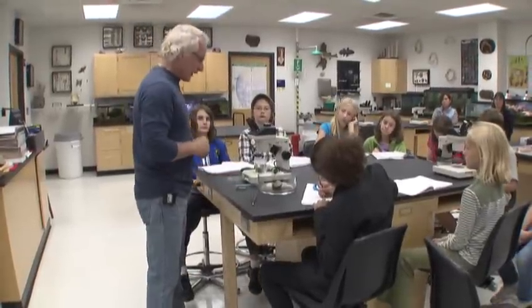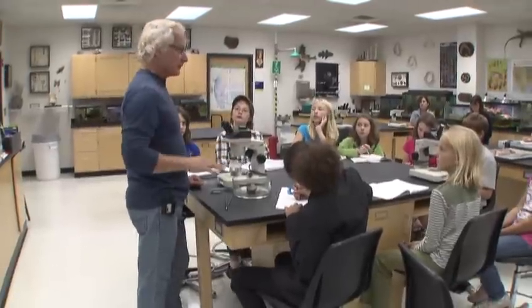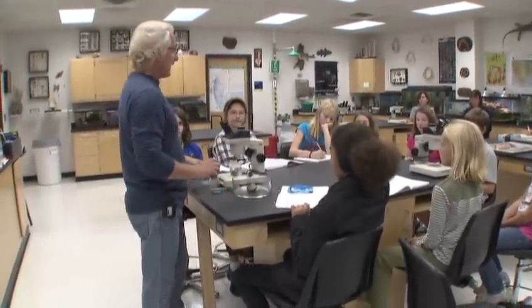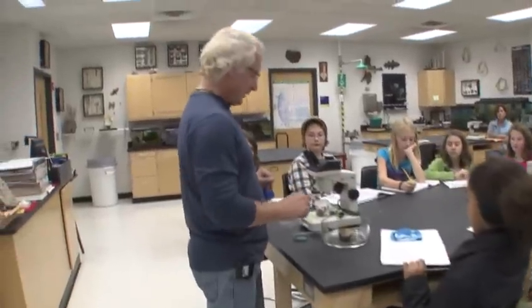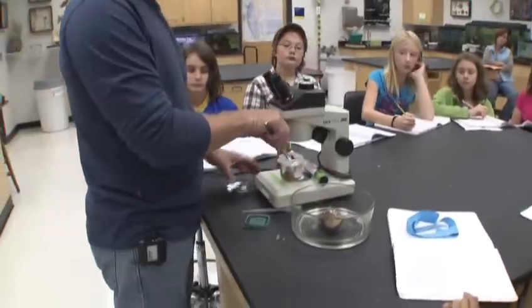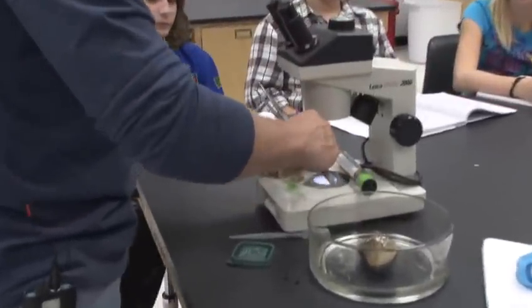So I'm going to start off with a relative of a mollusk today, and these are the segmented worms. Now, you know segmented worms because you've seen the European earthworm, which is now all over North America, right? So this is a segmented worm, and I'm just going to pass around the Petri dish, and later on we're going to look at it. But this one has these little tiny chitinous setae on it, and I don't want to hurt them, so I'm just going to... So we'll pass this around pretty quickly, as soon as I can get him out of here.